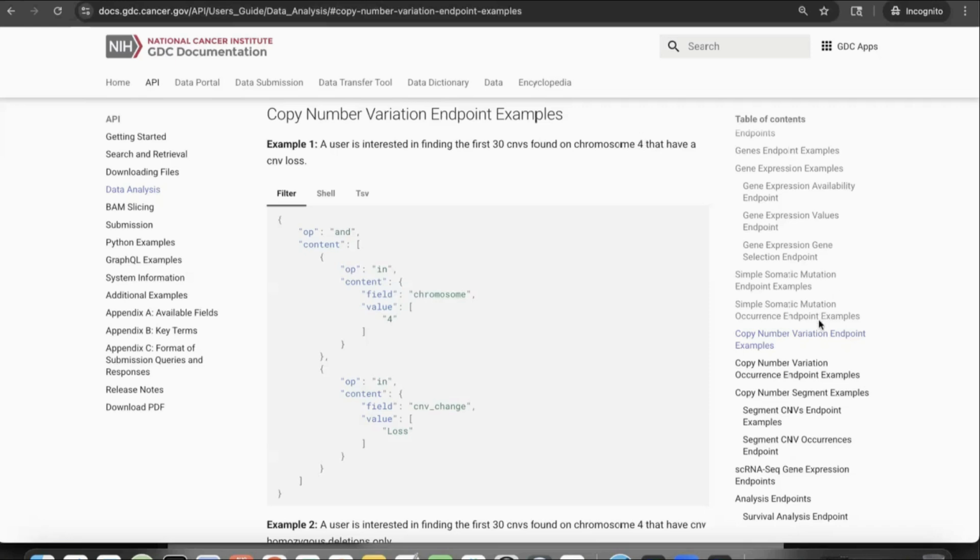The next question: instead of selecting by gene, can the visualization tool focus on specific disease samples? I also showed that in the disease breakdown panel, you can select a particular disease, organ site, race group, etc., to show the subset. The other method is to build up the cohort you want to look at in the GDC cohort builder, and then the CNV tool is cohort centric, and it will only show the data from that cohort.